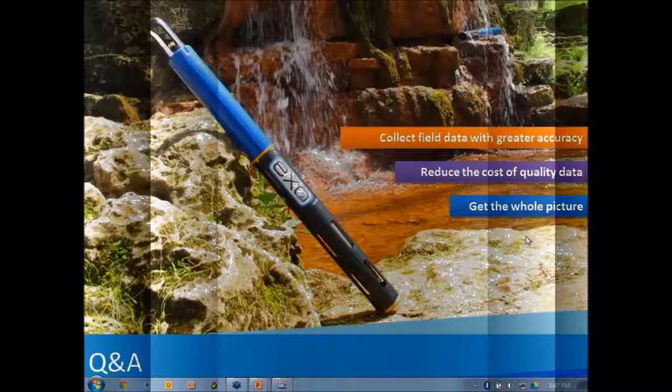A question here came in about, does the exosonde automatically adjust for temperature changes of the rhodamine dye or stream temperature? So the point here is, when you're doing the calibration, you need to use the lookup table and put in the appropriate temperature adjusted value. But then while the sensor is deployed out sampling or taking measurements, the onboard temperature sensor, the CT probe, the conductivity temperature probe, will automatically temperature adjust the output reading while you're taking the reading.